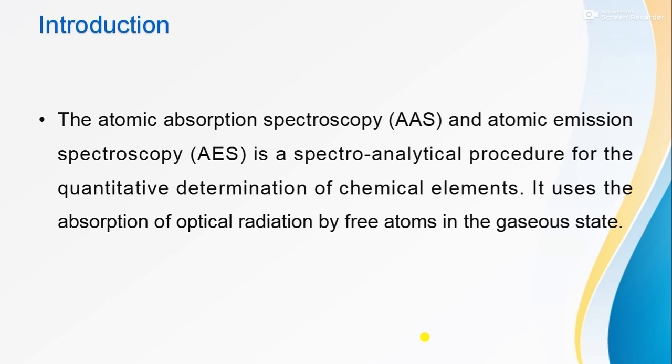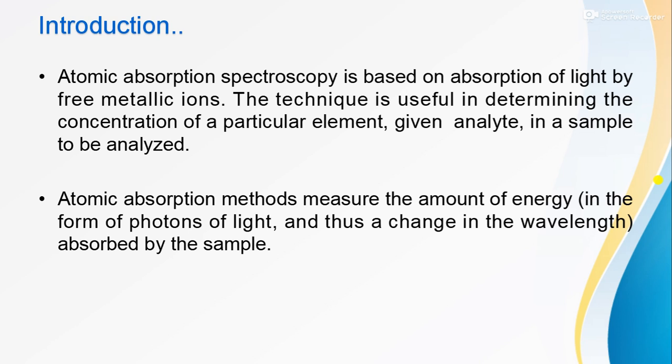Introduction. Atomic absorption spectroscopy, AAS, and atomic emission spectroscopy, AES, is a spectroanalytical procedure for the quantitative determination of chemical elements. It uses the absorption of optical radiation by free atoms in the gaseous state. Atomic absorption spectroscopy is based on absorption of light by free metallic ions. The technique is useful in determining the concentration of a particular element, the analyte, in a sample to be analyzed.